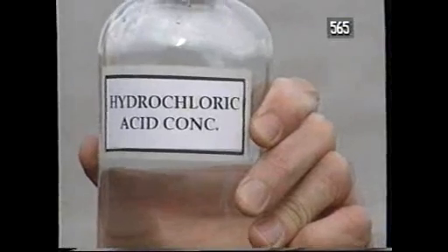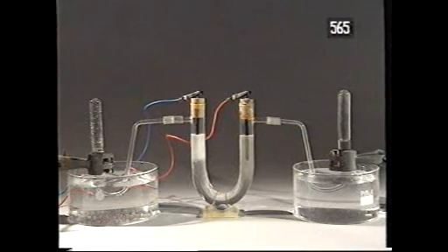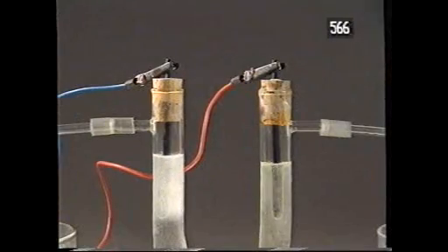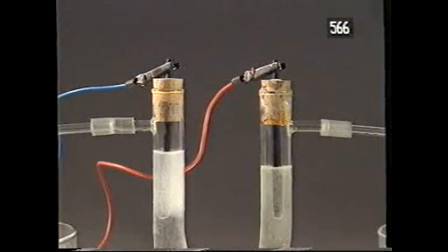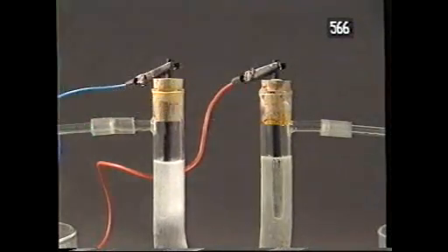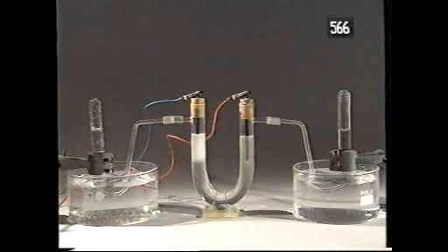Their solutions conduct electricity. I'll show you what I mean by using concentrated hydrochloric acid. Here I'm doing to concentrated hydrochloric acid what I've already done to water, taking it apart by passing an electric current through it. Again, it breaks down into two gases. This one, at the negatively charged electrode, is hydrogen. The other one, at the positively charged electrode, is chlorine. You can see that the two gases are produced in equal volumes.